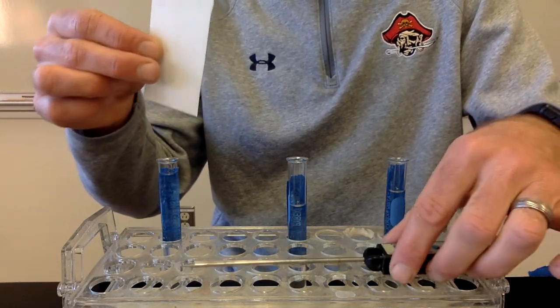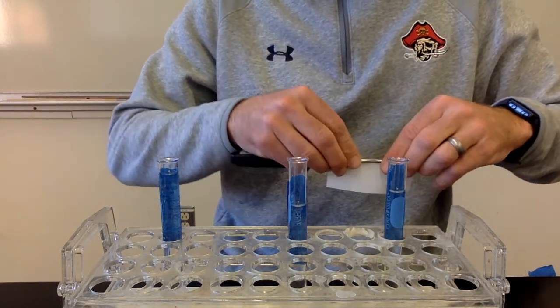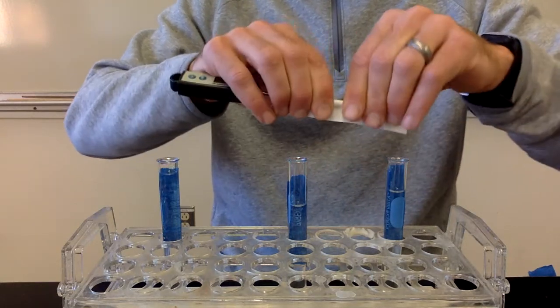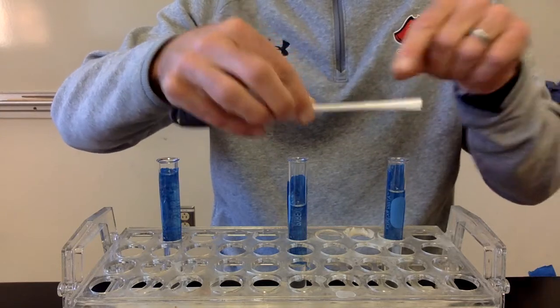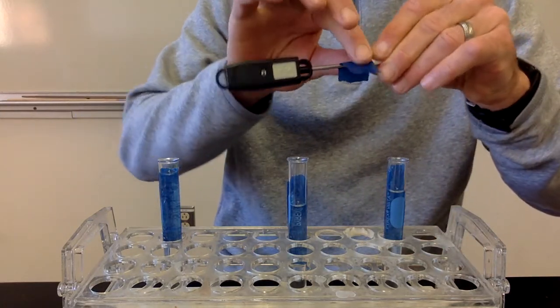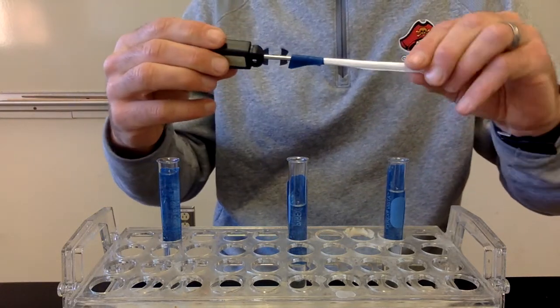All right, so the way we're going to do this, we've got a thermometer and we've got a piece of filter paper. And I'm going to roll that piece of filter paper around the thermometer. So it looks kind of like this. So we've just got a piece of paper wrapped around a thermometer, and the paper is just so that it can absorb some of the liquid and hold it against the thermometer.